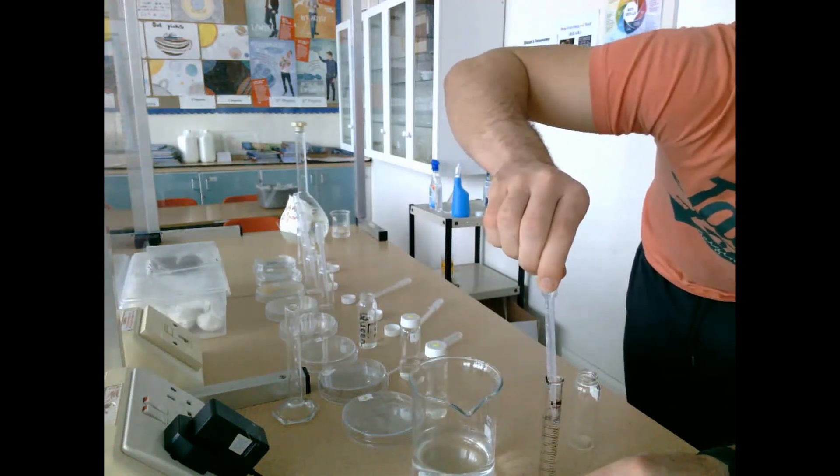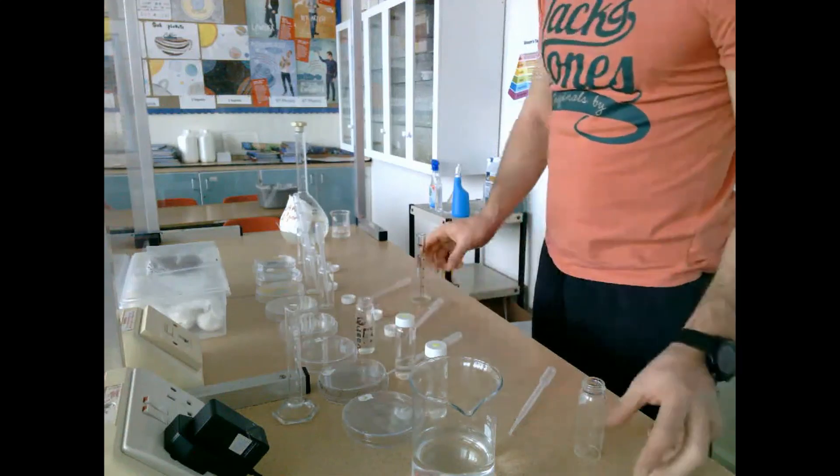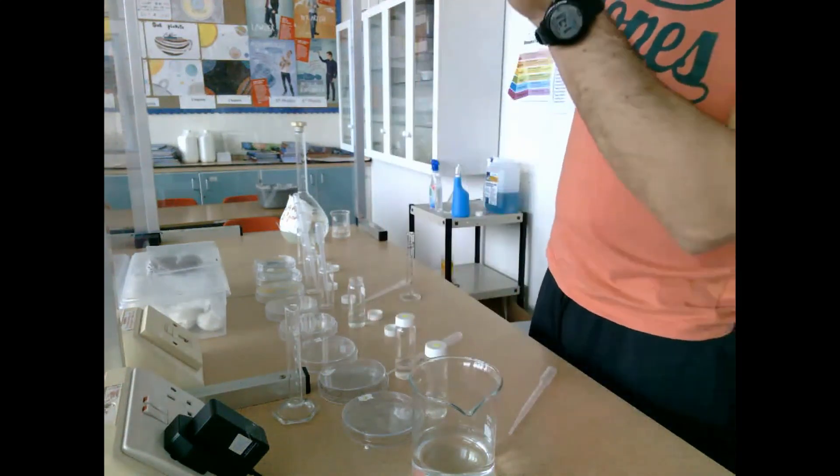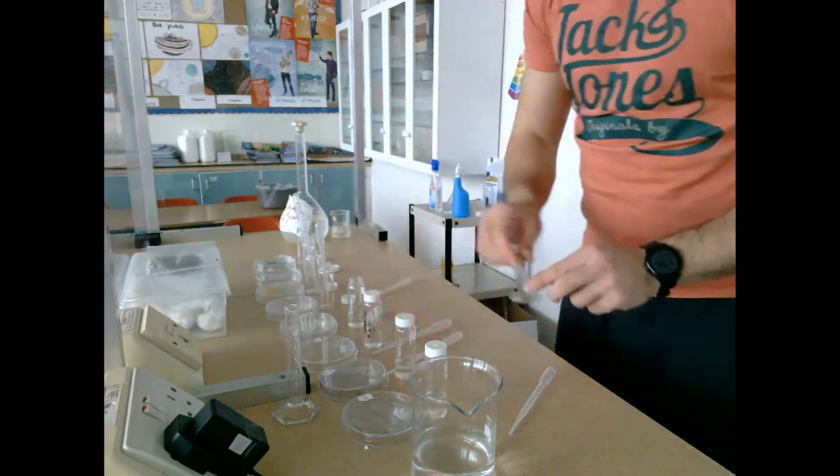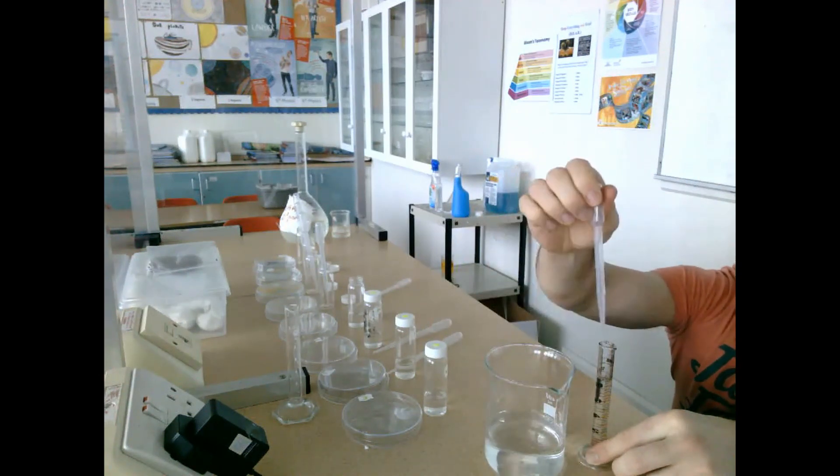For each new glass jar, we add nine milliliters of water. Then we go to the previous glass jar, take a dropper, remove one cubic centimeter, and add it to the glass jar we just filled with nine milliliters of water. This continues from glass jar number one all the way through to glass jar number eight.